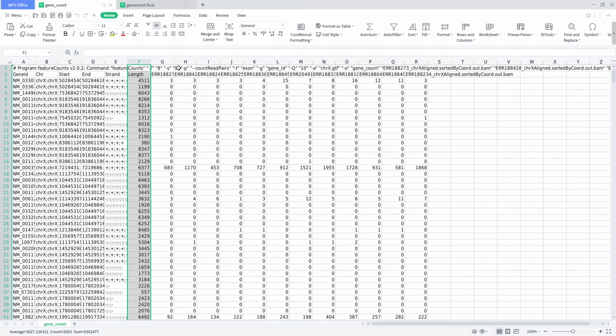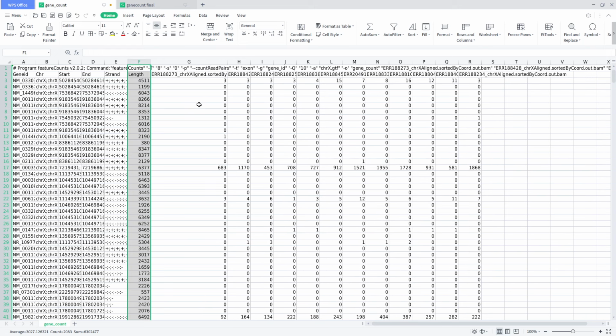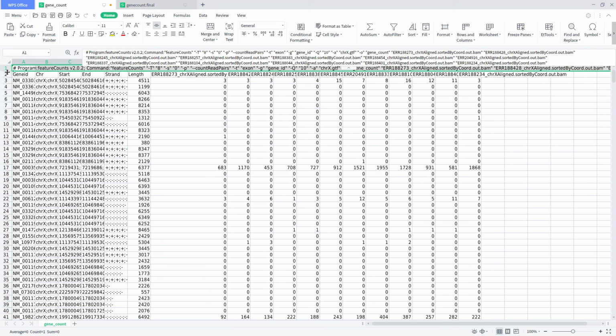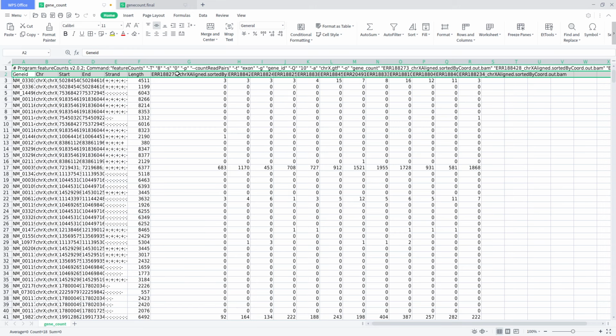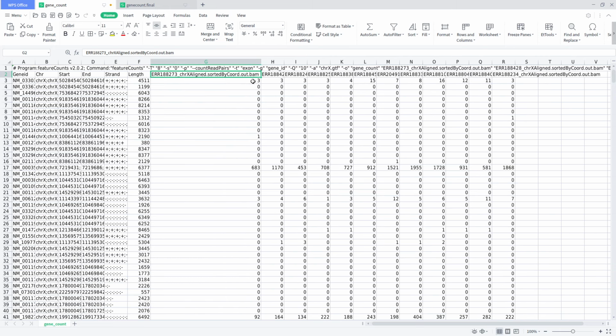Now you also notice the headers. The headers that we see, we have one here, we also have one here, and these ones, which also has a sample like this, we see it has the name. The name is very long. It has the name of the BAM file. This is something that we can properly format, still using some Linux commands and also still in the Nextflow scripts.